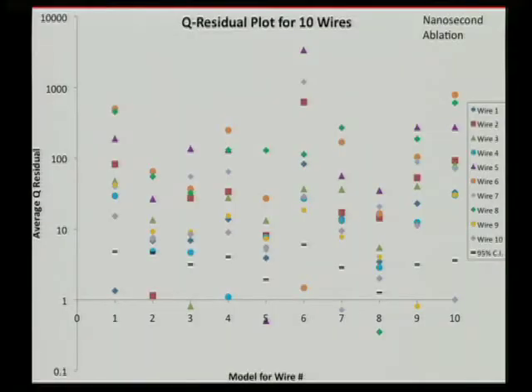And so now this is comparing the wire strands to one another. And the take-home message here is just that every single wire strand can be differentiated to 95% confidence. Let me rephrase that. To 95% confidence, every strand is distinguishable from the other.